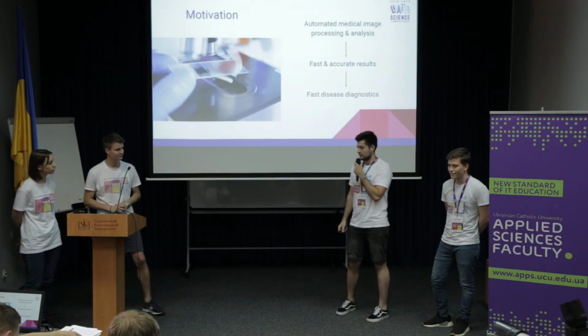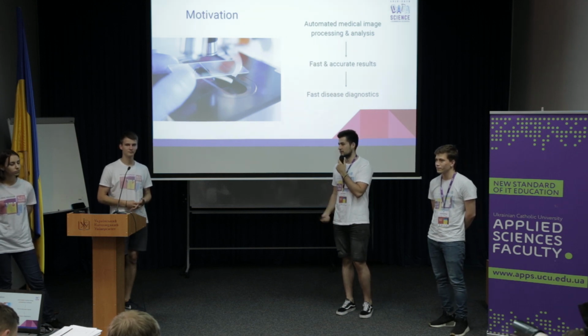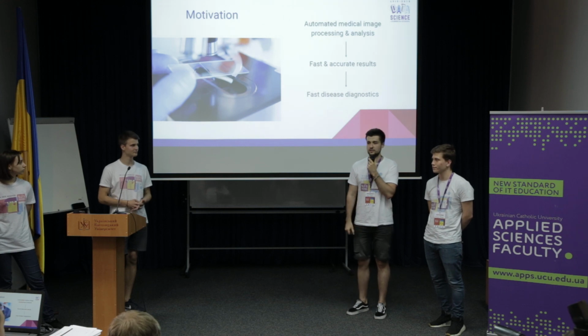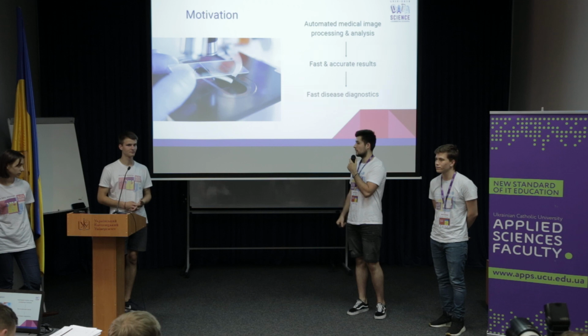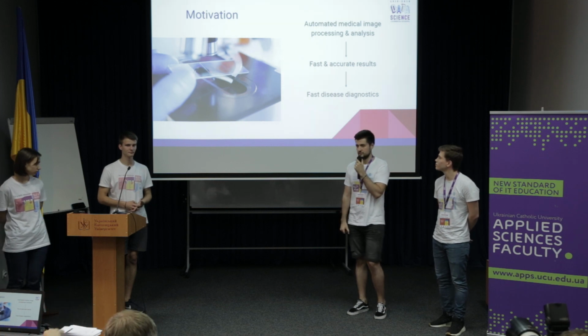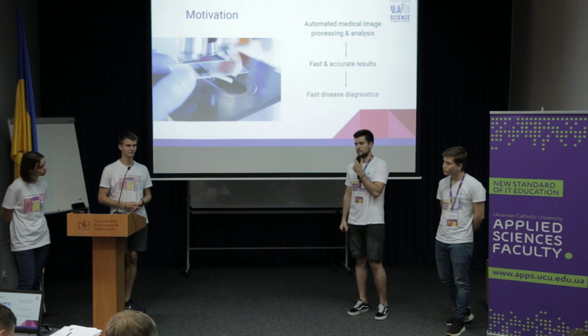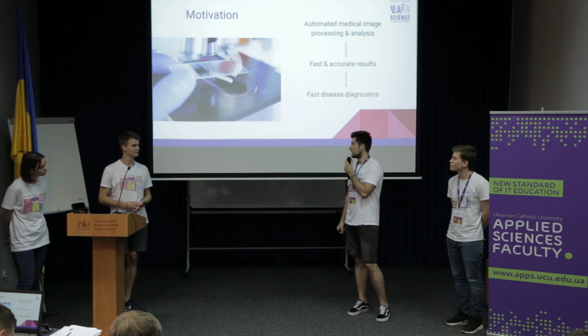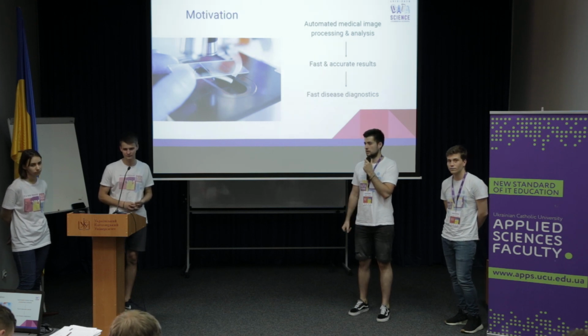Yeah, so our main motivation for such a task is that creating a model which will automate tissue segmentation from microscopic images can be very useful for various researchers, mainly to improve the speed of finding cures for diseases ranging from rare diseases to common colds.